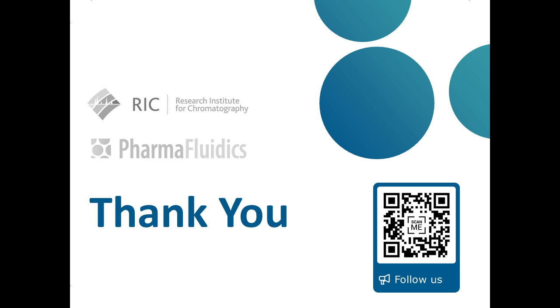And have you done any HCP work on the NIST mAb? And if so, how many HCPs were identified? Yes, we performed already some experiments on the timsTOF Pro instrument on the NIST mAb. It was a slightly different approach where we used a sample preparation according to the Lilly paper from Huang et al. And there we could identify 316 protein identifications with 1 peptide and 91 protein identifications on at least 3 identified peptides.